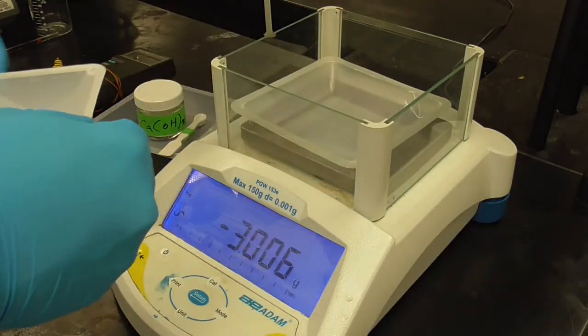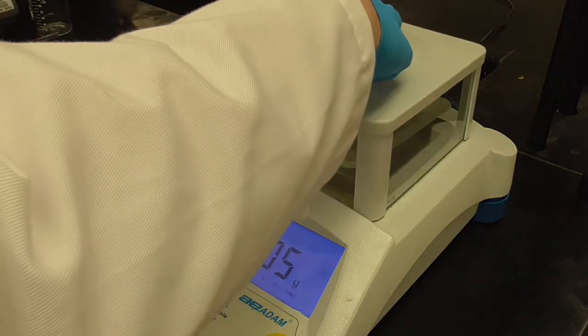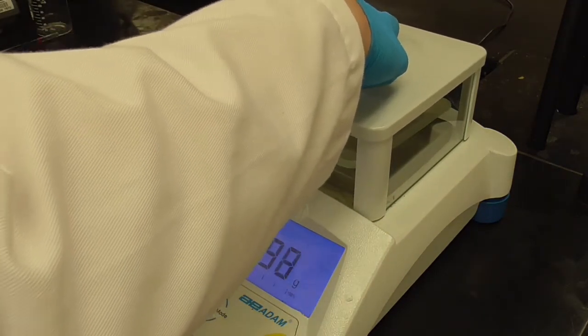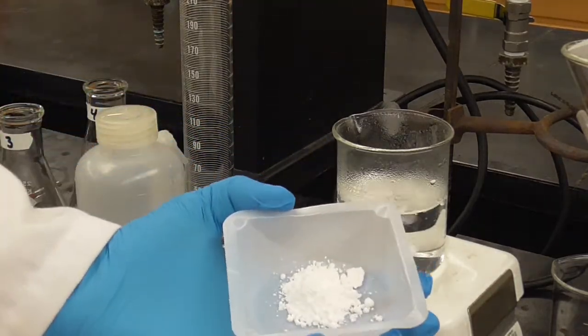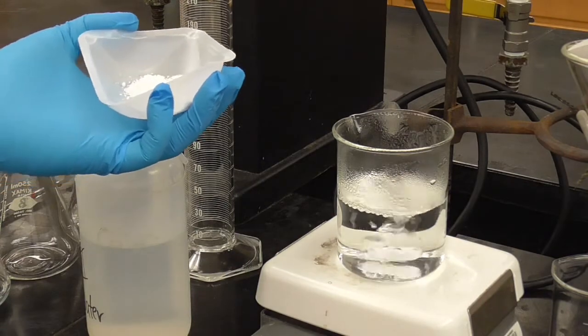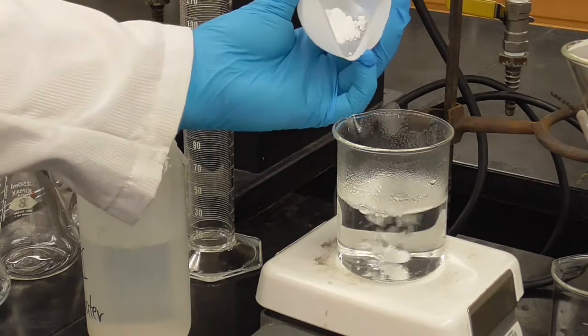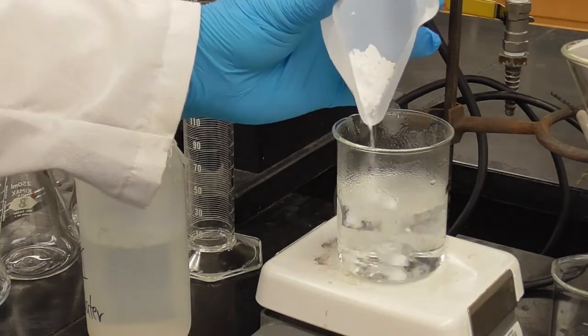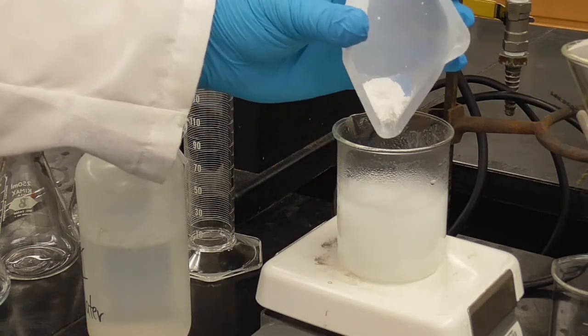Okay, and then once our solution is boiling again, we're going to add that to our water and let it boil for a little while. So here's the white solid. We've got our solution boiling, and it's been boiling for a little while now. I'm going to add the solid, and then it has to boil for 5 more minutes, so we won't bore you with that. Get all that solid in there.